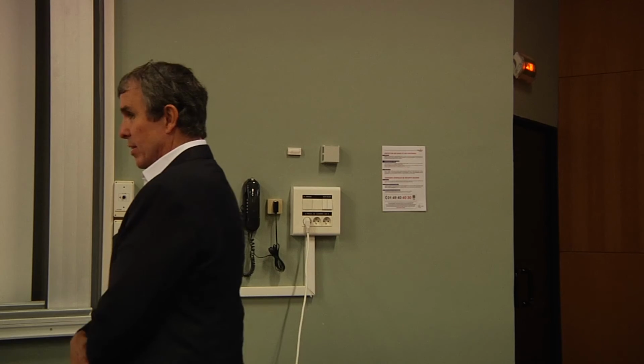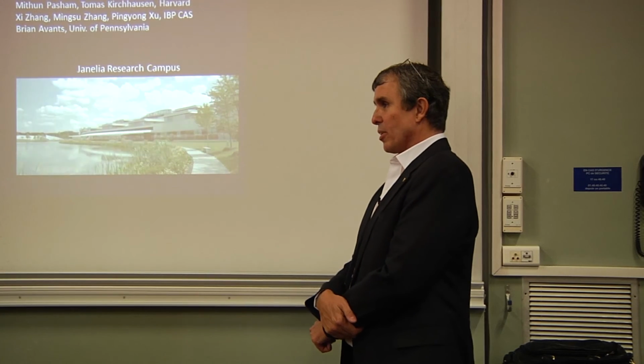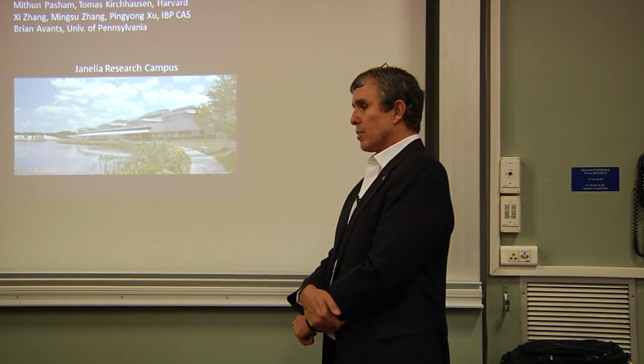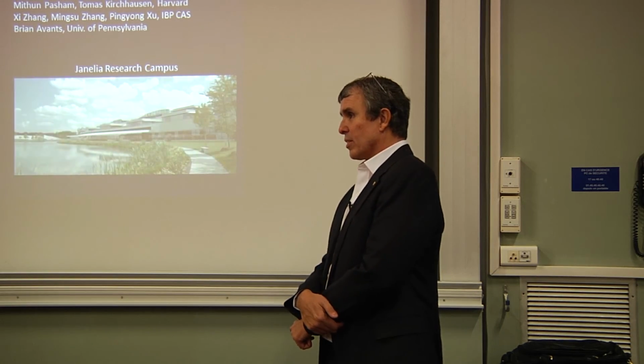Yes. There should be questions from data processors. Image processing is a big deal. You mentioned we're swimming in electron microscopy. Right. And when I speak with an electron microscopist, they said, you really believe this is the real image? No, it's after data processing. Exactly. And it seems that what we have seen here is without data processing.